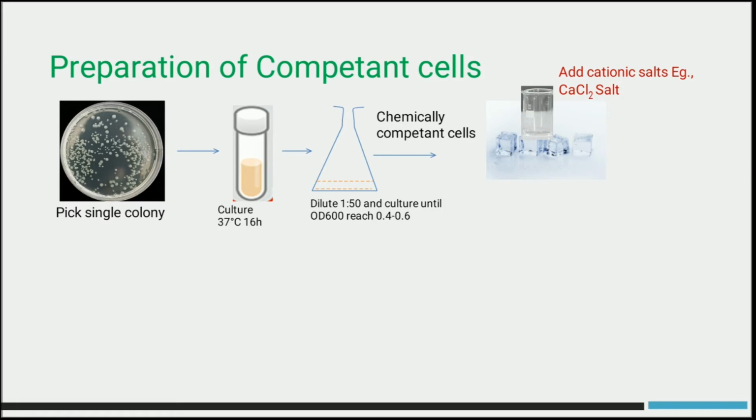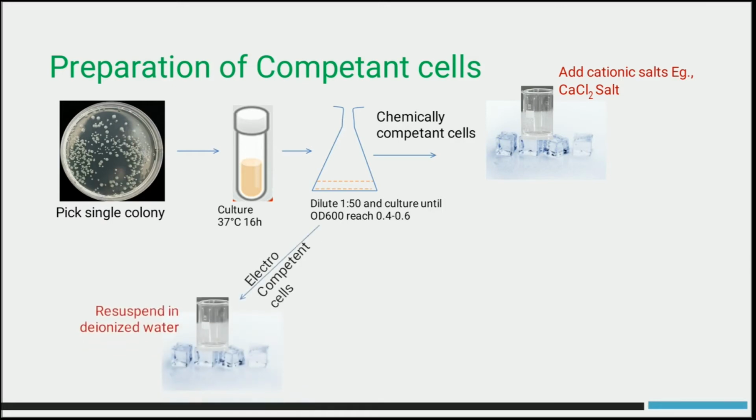At millimolar levels, we prepare the salt solution, and we have to mix the pellet with this kind of salt solution and keep it in ice for 10 to 30 minutes. Whereas in the case of electrocompetent cell preparation, we resuspend the pellets in deionized water and keep them in ice for 10 to 30 minutes.